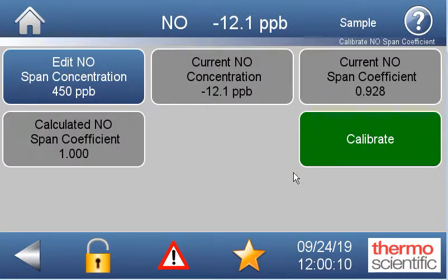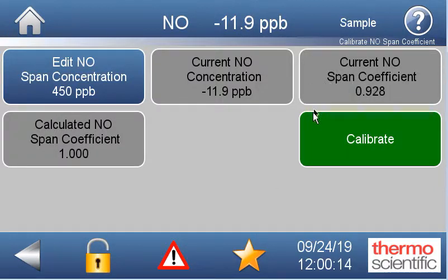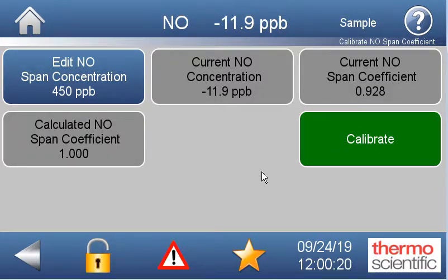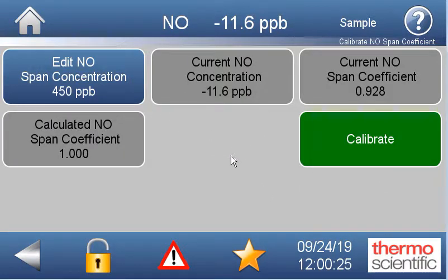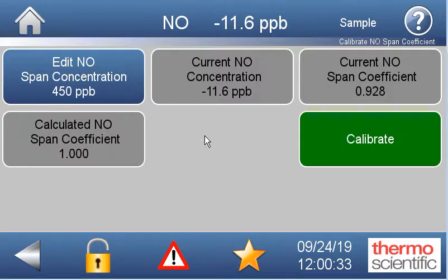Generally I like to keep those within 20% or so — so 1.2 to 0.8 is a pretty good span coefficient range. These are more software adjustments, whereas the PMT is a hardware adjustment. So that's the procedure: calibrate the background, set the spans to one, go in and calibrate your PMT, and then fine-tune the zero and span again using these software features.